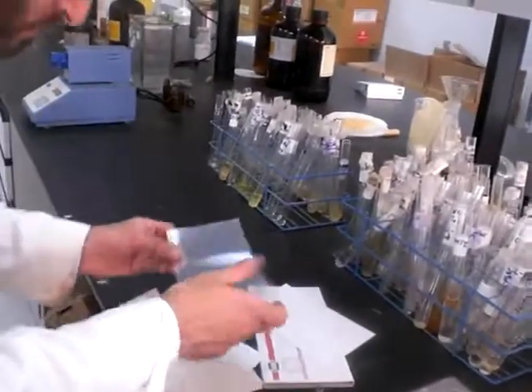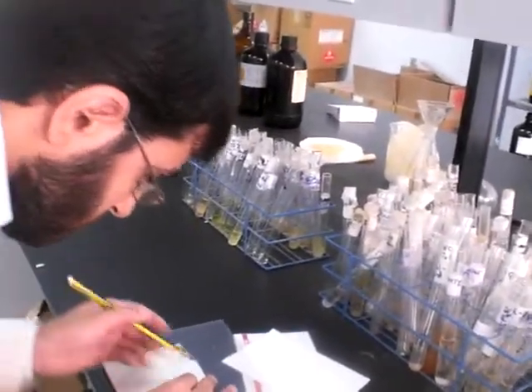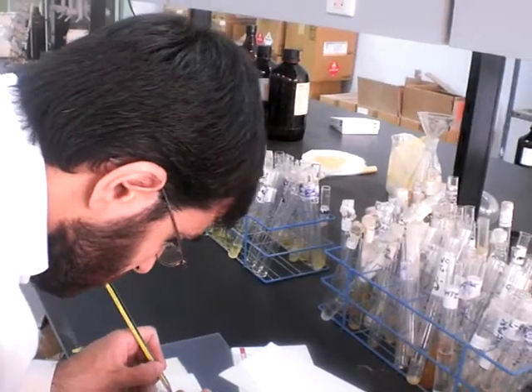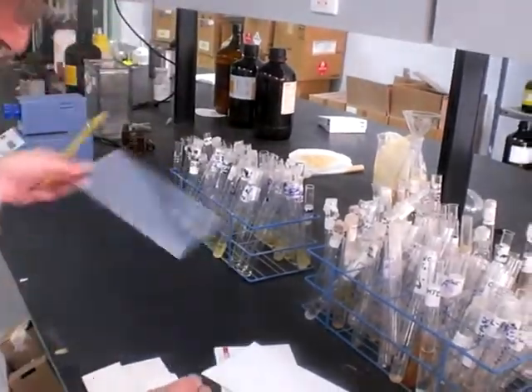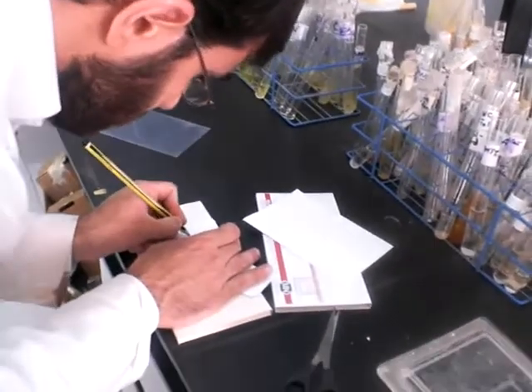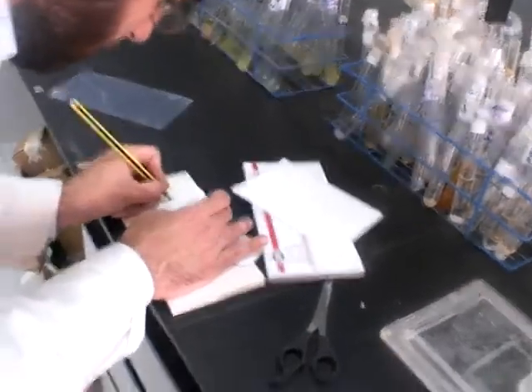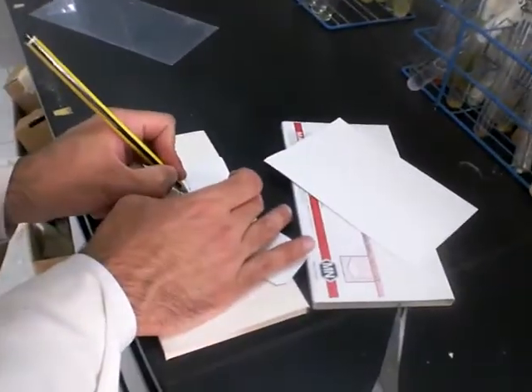The idea is we will add a spot of reactant and a spot of the reaction solution, then we will see if we have a new spot or not. If a new spot is obtained, this means that we have the product, otherwise we don't. So by pencil here we add the numbers we know in order to follow them later.